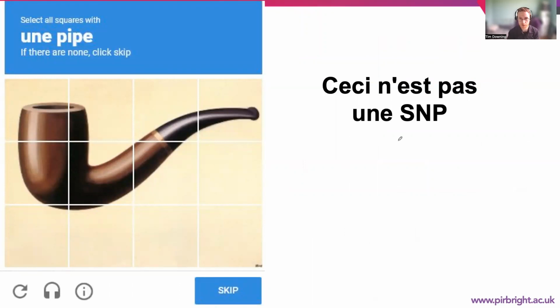So this might sound a bit philosophical, but we have to remember what our data is: a representation of a potential nucleotide variant, with lots of different features that indicate that it may or may not be, depending.